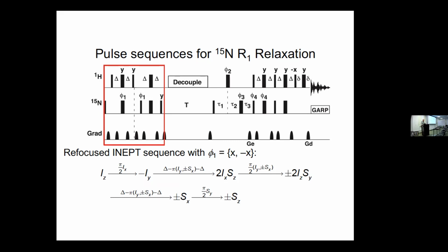In the beginning, one tended to fit an offset, but that was really prone to ending up with offsets that were really the noise, not the real value. So in practice, it's always done this way, almost always done this way.